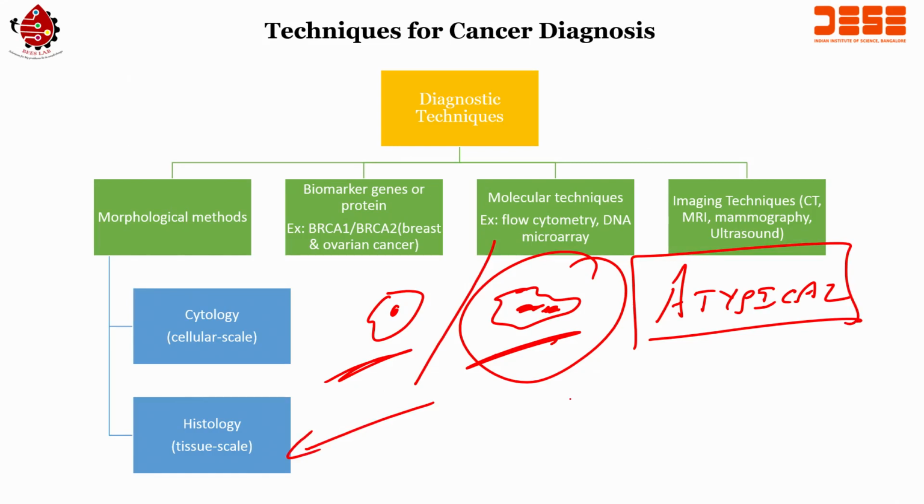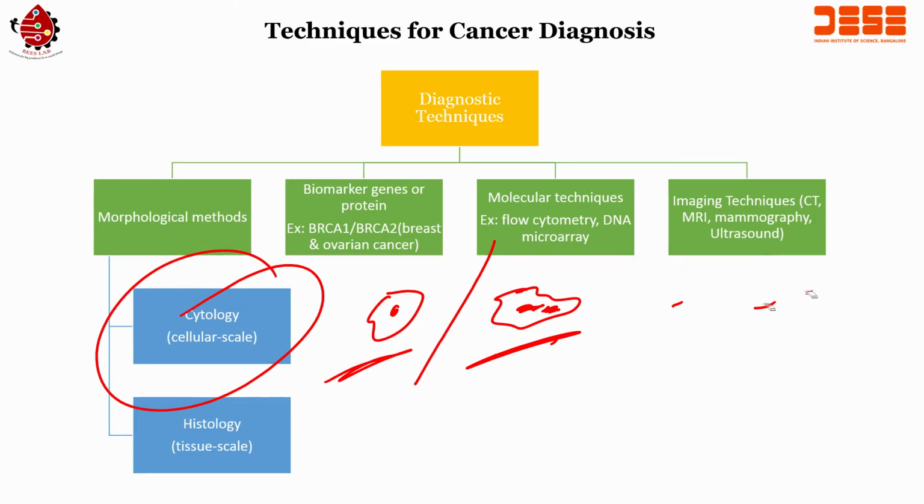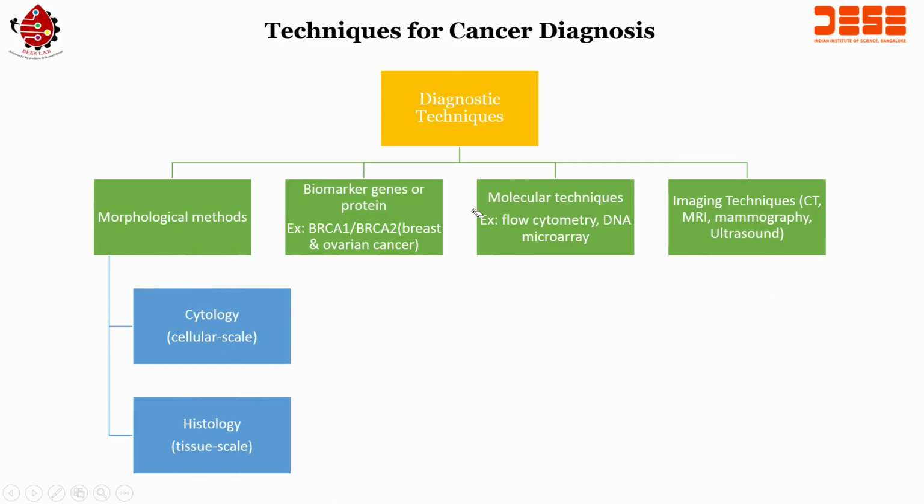So, our idea is to understand the cytology properties of a cell and to develop a device that can help to screen the patient faster, screen the cases faster. This will reduce the burden on the hospitals as well as help the patients. To see why we are doing this, I will show you two different videos of how the cells are taken from the mouth.